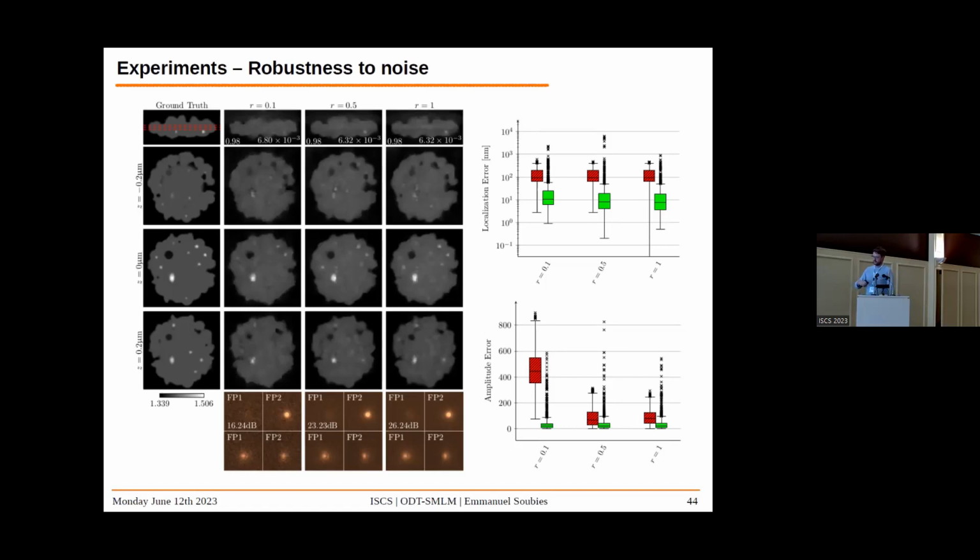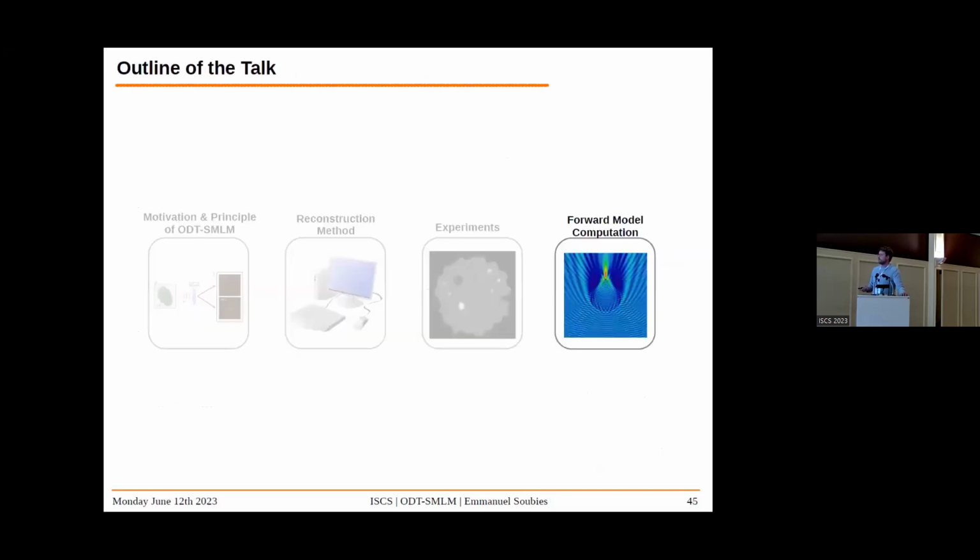been enlarged, and this is because our initial estimation of the refractive index is very poor, and given the first optimization we do for the position and amplitude, it can move away. We should be able to correct for that, to detect these ones and reinitialize them, for example. I mean, we didn't have a look at that.